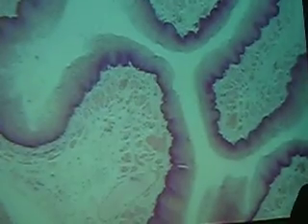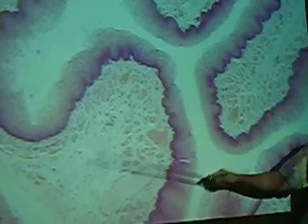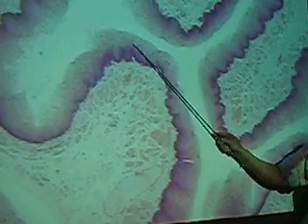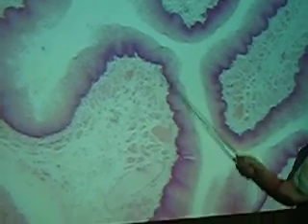Slide. And again, I'll tell you what the slide is so that you'll at least know where you are on the slide. Okay. This is the esophagus cut in cross section, so that's the lumen. And now this is where those 4 large layers start. If I were to ask you guys to go from here to here, that's one large layer, and then here's the second one. This is called the mucosa. And it's purple, light, pink.